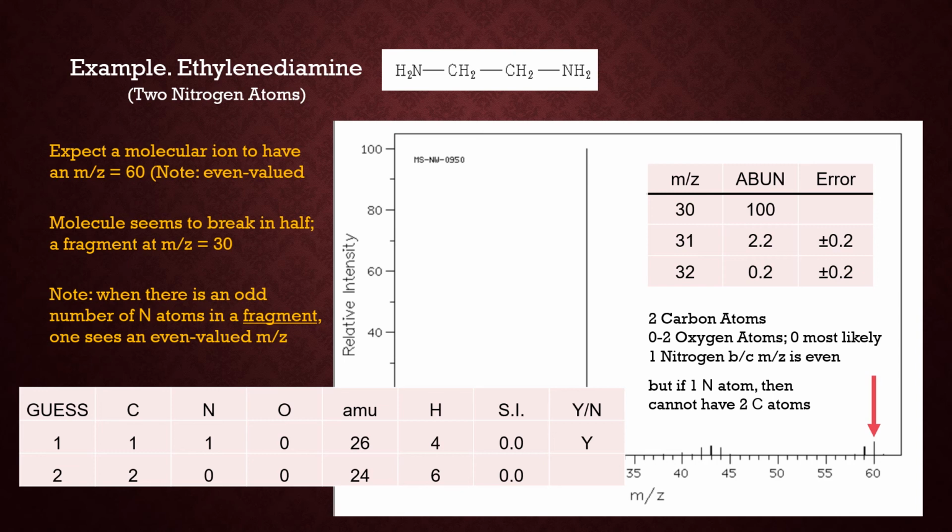There's nothing wrong with it. It does give me a saturation index that's reasonable. So I would probably keep that as an aside, but recognize that the combination of the isotope factors, namely the 0.4 and the 1.1, does get me up around 2. So the molecule does seem to be splitting in half.